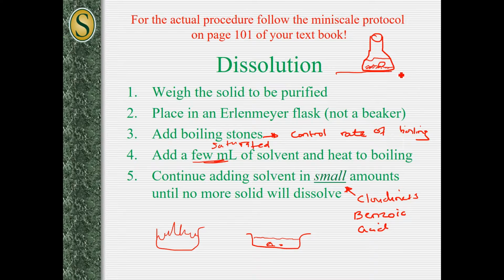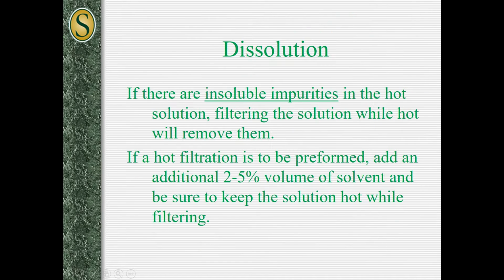Meanwhile we will be heating our sample on a hot plate. The sample will be sitting on a hot plate and heating. We want to keep it hot so that the benzoic acid will dissolve. Okay, and then as the benzoic acid is dissolved, we're going to filter the solution while hot by gravity filtration. So the heating just helps to dissolve the sample. We call that process dissolution.